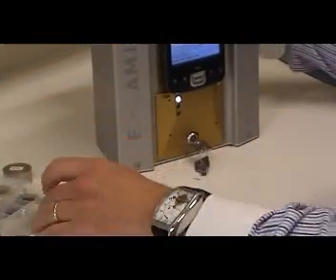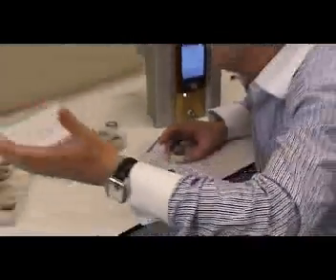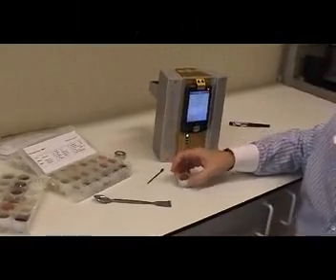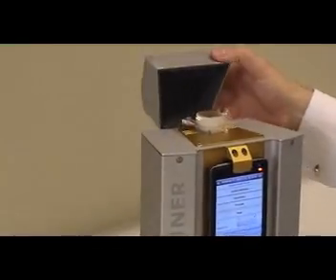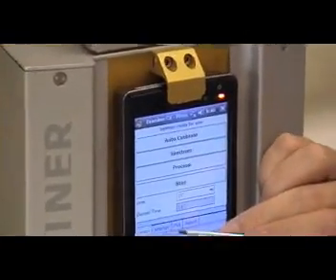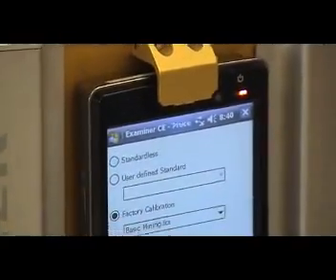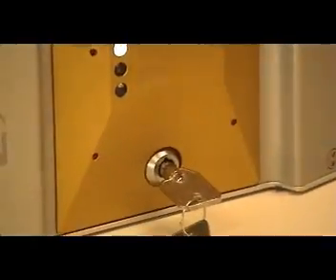So what we normally do now is go to the field or to the lab — we want to measure the sample. We are going, for example, to measure chromite, which is number 13. In chromite, I would normally expect around 24–25% of chromium. So the only thing to do is you take the vial, you put the cup on here, you close the lid, and then we go through the program in a few seconds. You only have a few buttons. The most important thing is that we put the exact calibration in — we can use this for mining applications, for which the analyzer is calibrated.